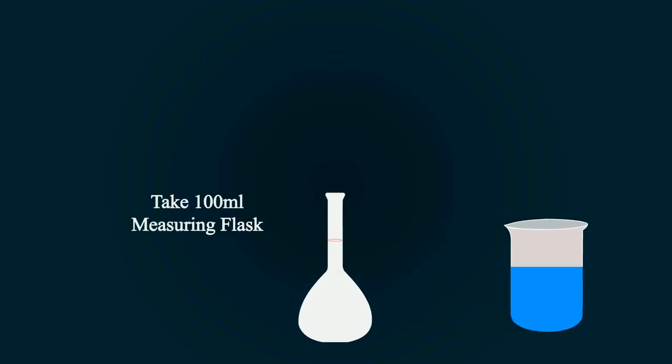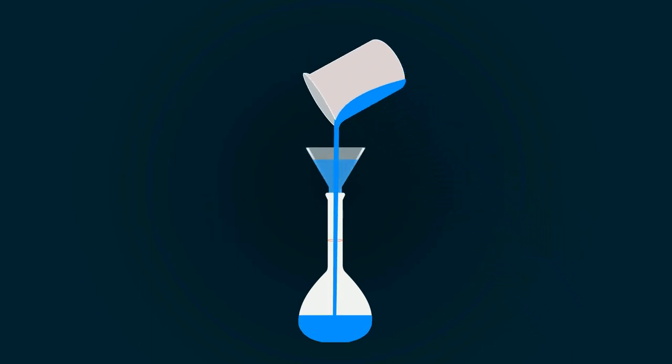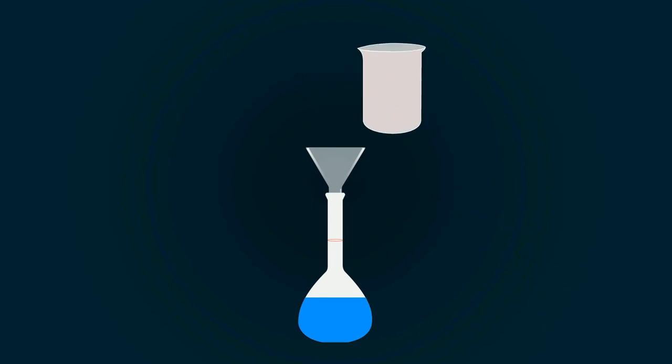Now take a measuring flask of 100ml and put a funnel on the top. Now start pouring the solution into the volumetric flask. You have to fill it up to the 100ml point.